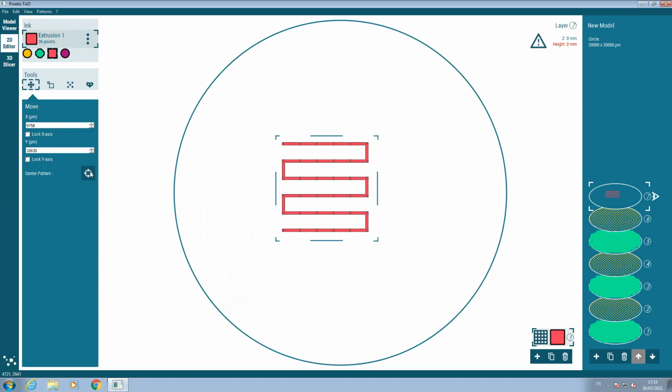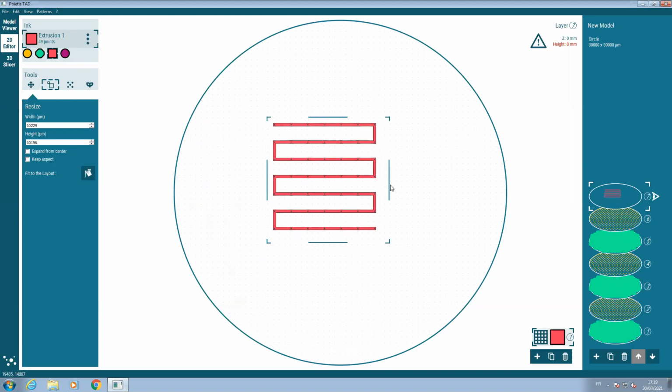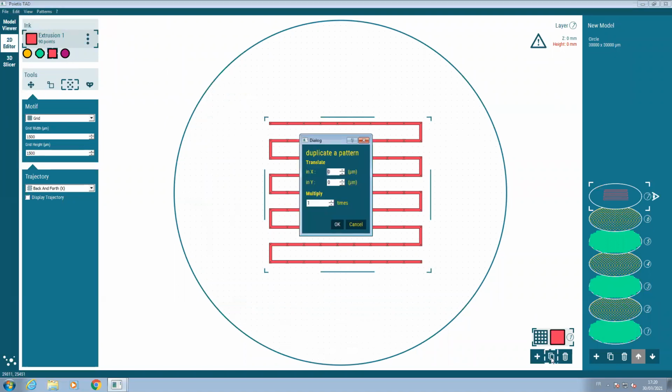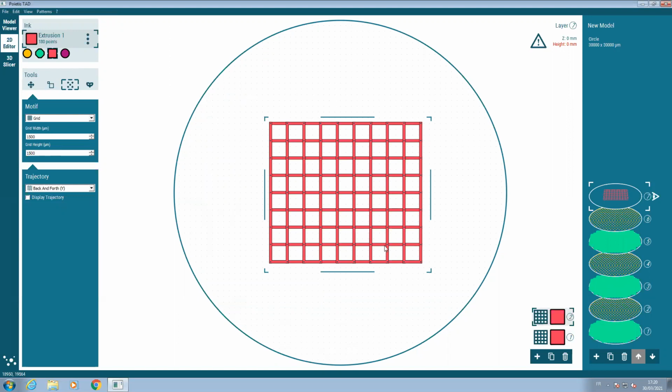Now, one application that we developed is to create grids, something that we had during our experiment for a customer. So it's pretty easy to do that. You just have to choose the size of your grids. So you can enter it here or do it by hand as I do. Then repeat the pattern. Oh, sorry. Up here, repeat it. Okay, and then doing this. Here you can obtain easily a grid.